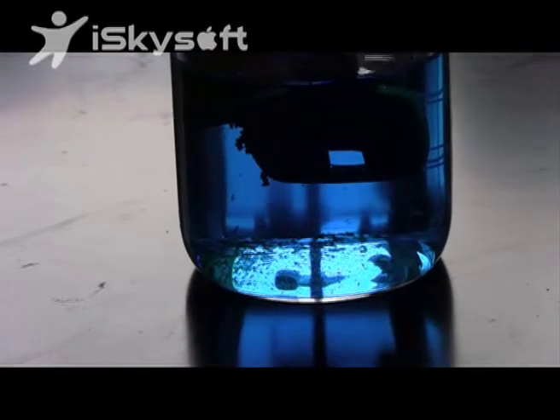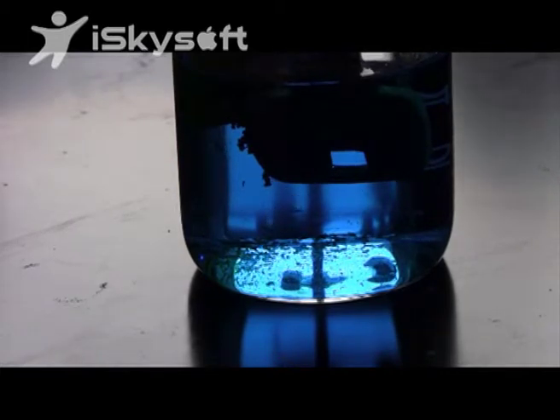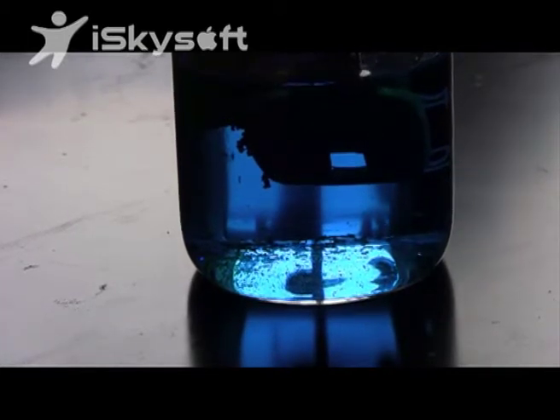Now some effects start to take place. The copper, as you can see, is starting to lose its color, and there are some chunks floating around. Here you can clearly see the chunks floating around the solution, and if you look closely on the left side of the beaker, you can actually see some swirls in the solution.